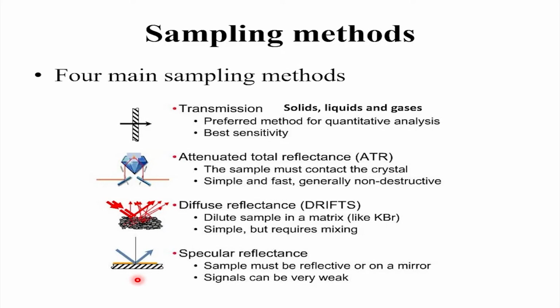If you don't have a metal oxide in your powder sample, you can use the ATR method. The problem with metal oxide is that the ATR range is restricted by the ATR crystal. If it is a diamond crystal, the ATR range will be at most 4000 to 650 centimeter inverse, and all metal oxides have a peak below 650 centimeter inverse.